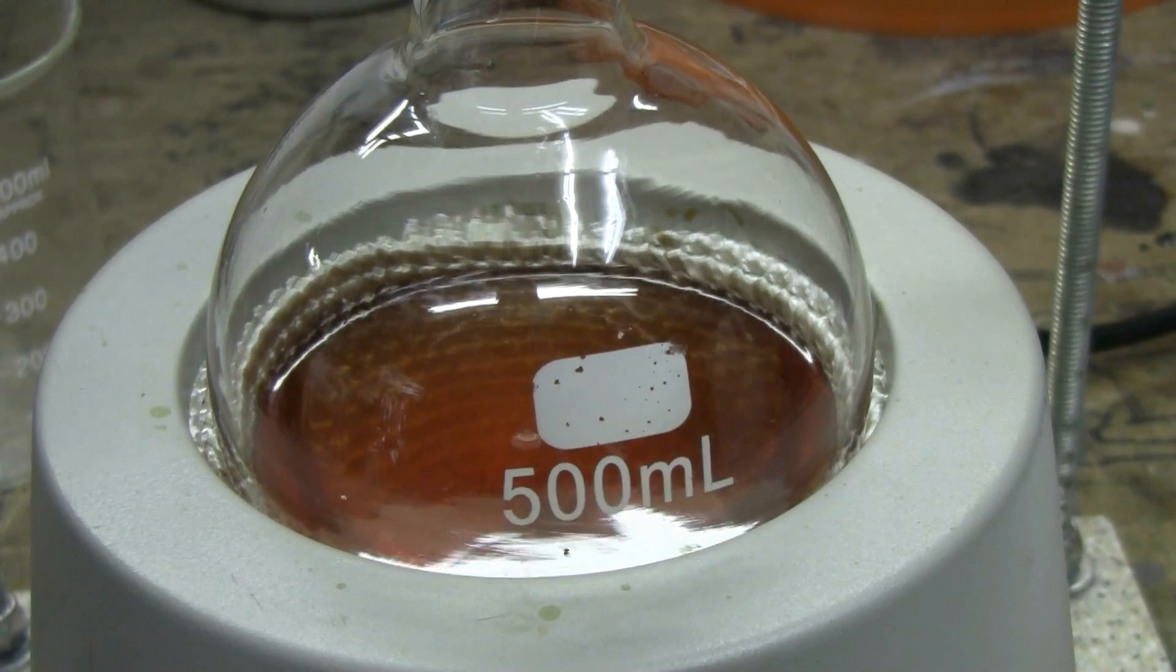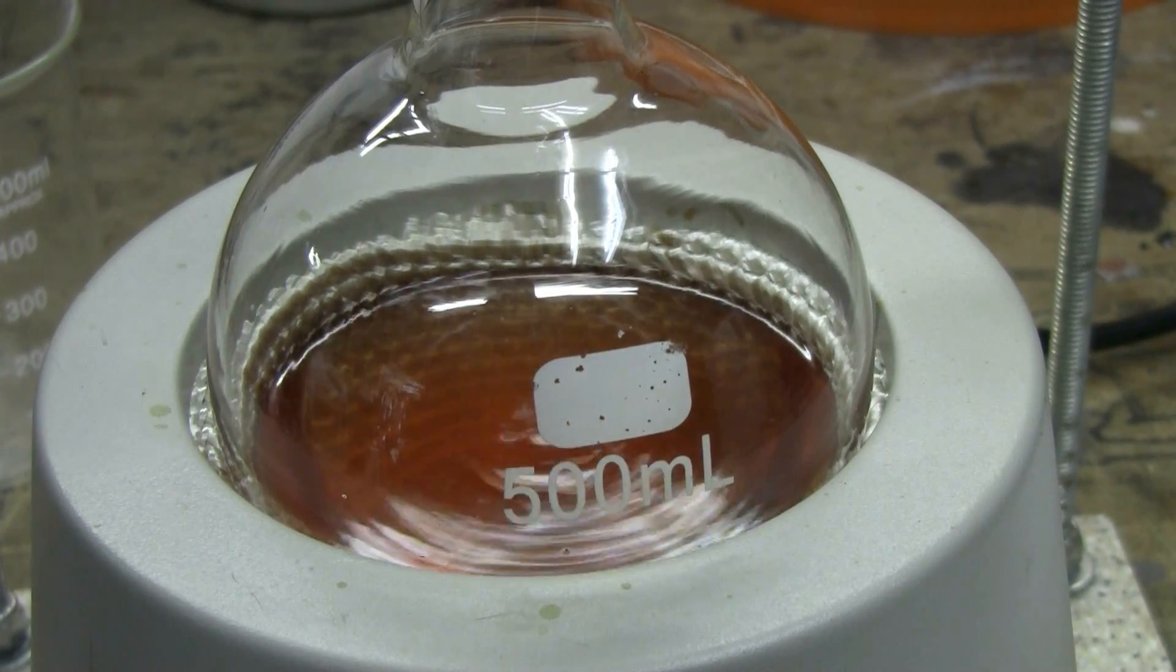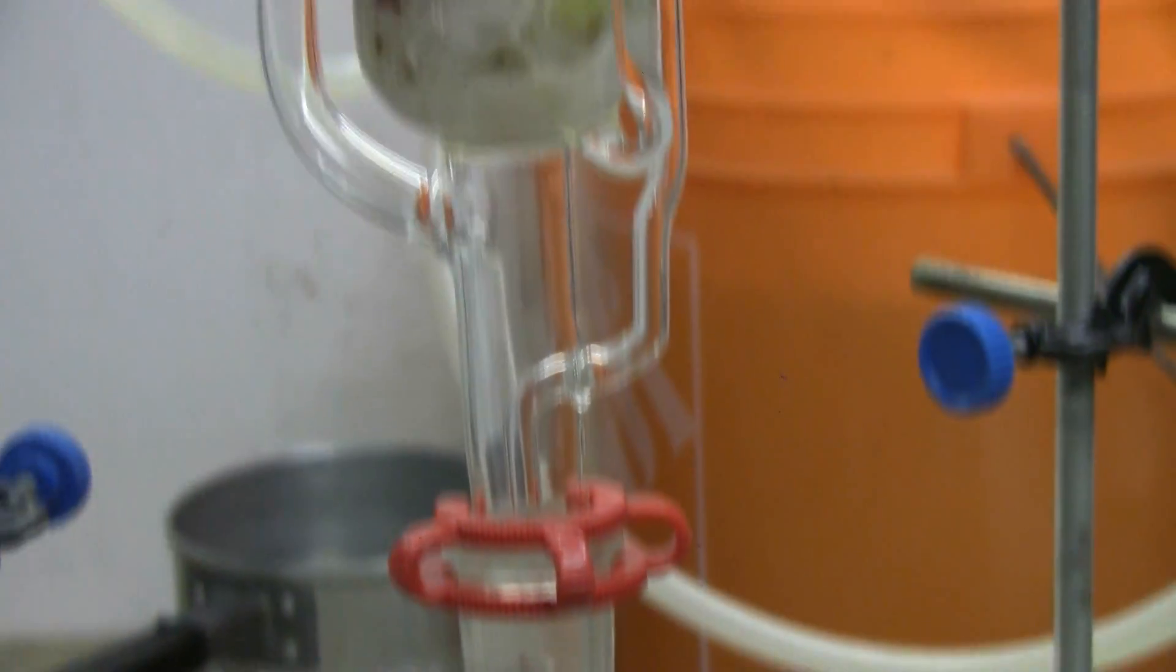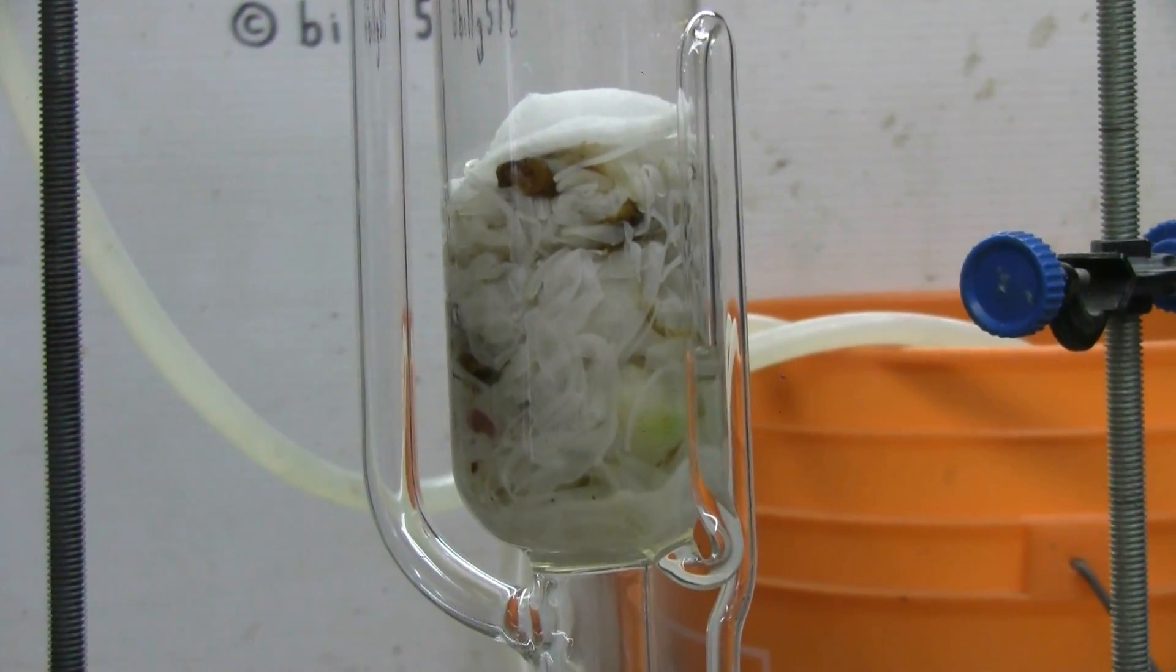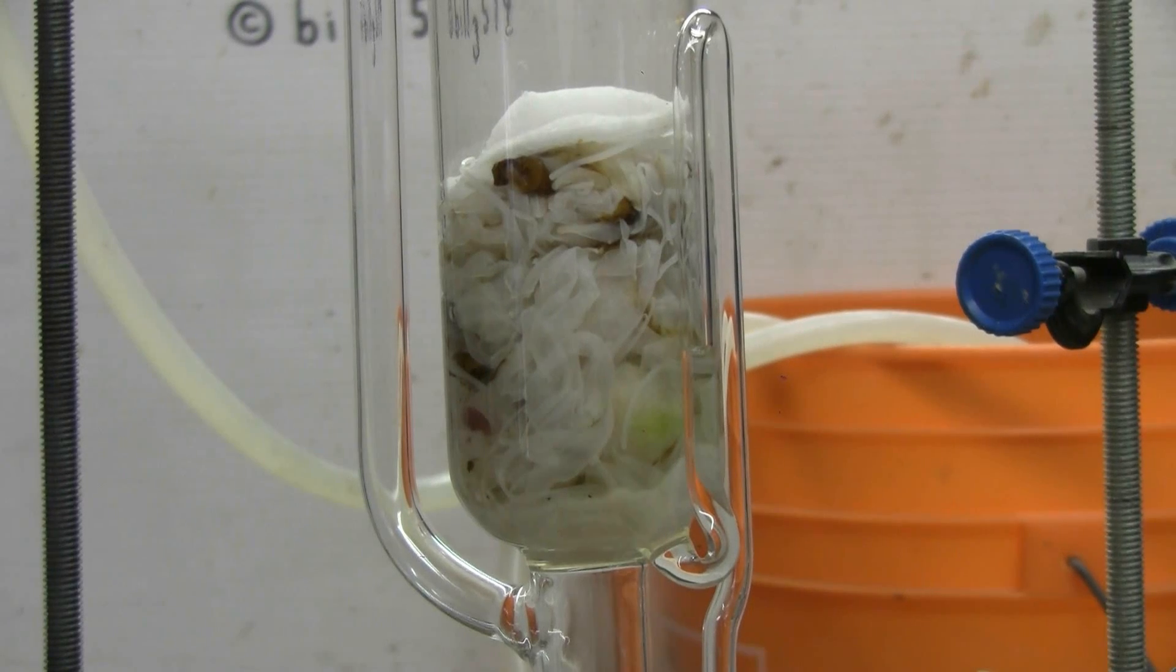With ten cycles completed, the extract down in the boiling flask is a nice rosy pink color. The formerly colored peony flowers themselves are now bleached pretty much to white in the Soxhlet chamber. So this extraction is finished and I can proceed with simple distillation to recover my ethanol.